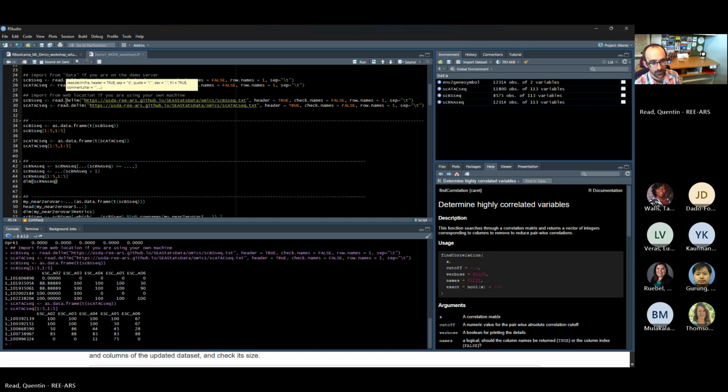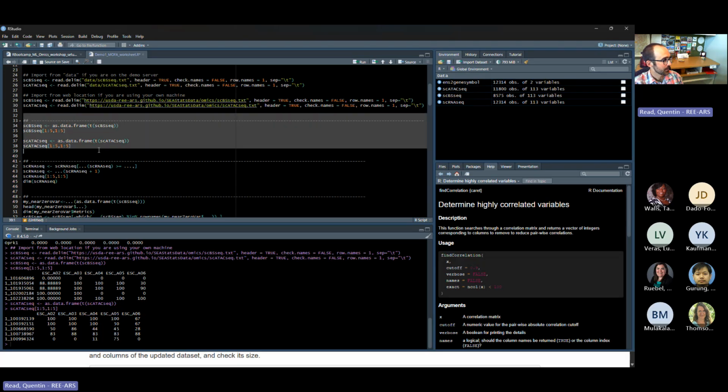It's just saying that it's reading the delimited file. I see. Is it just being slow or what? Well, the stop sign is gone. But did the error pop up? Do you see one each of these three things in your environment? Yes. You see them now? I see those, but I don't see the table like you have. Okay, well, yeah, then you have to run these following lines for that.